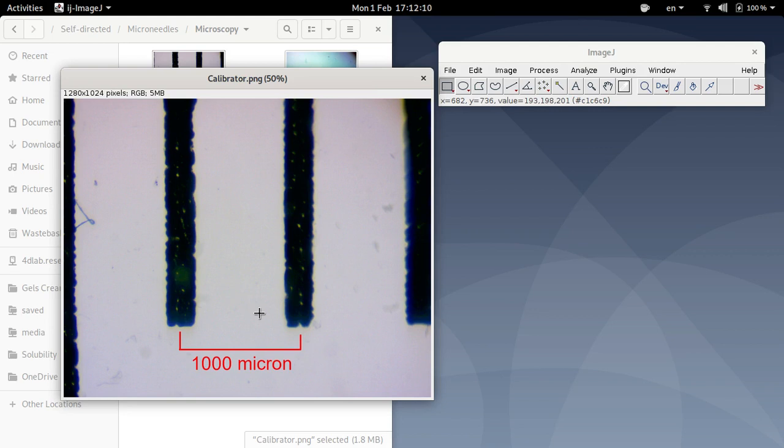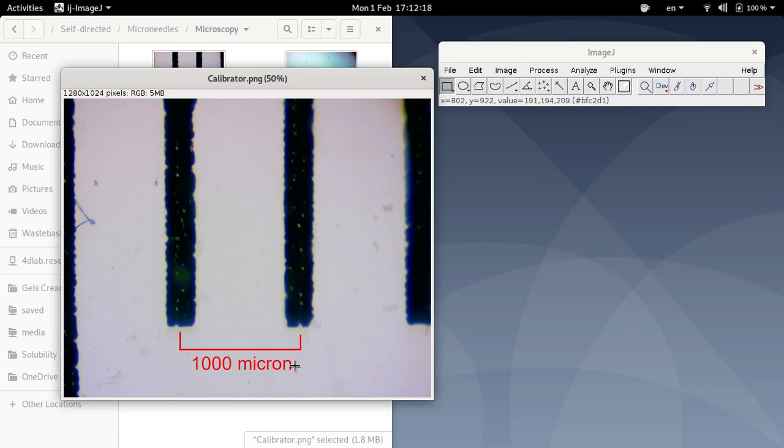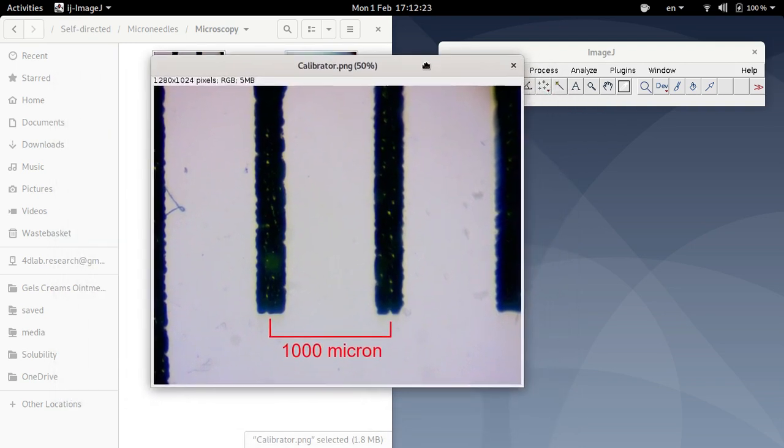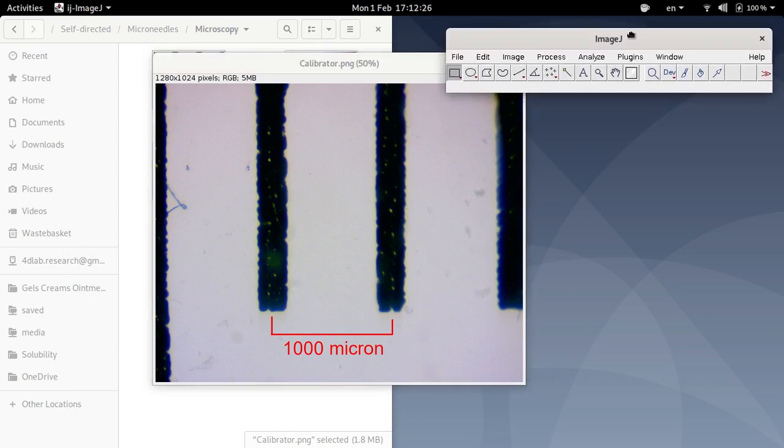So in this case for example we know that the distance between that point on the image and that point is a thousand micron. So a micron is a micrometer. Okay, so we're going to use this image to calibrate our measurements.